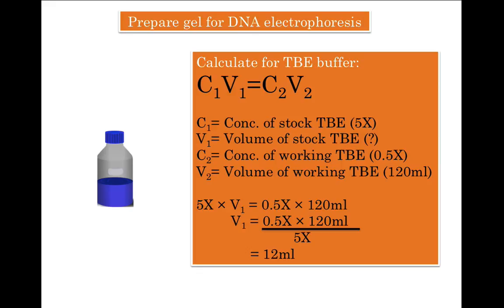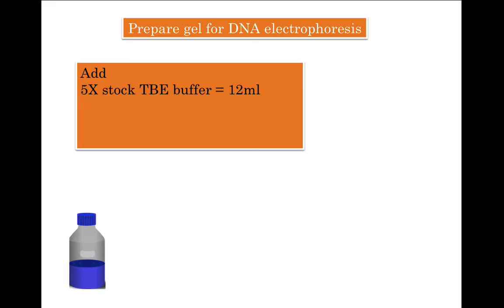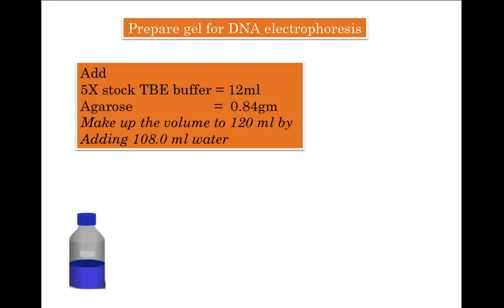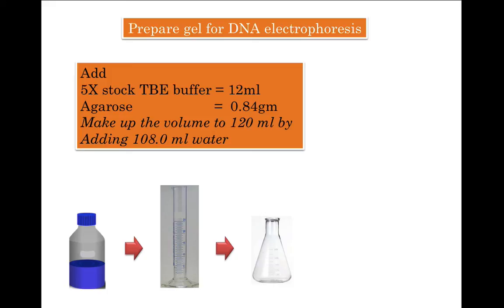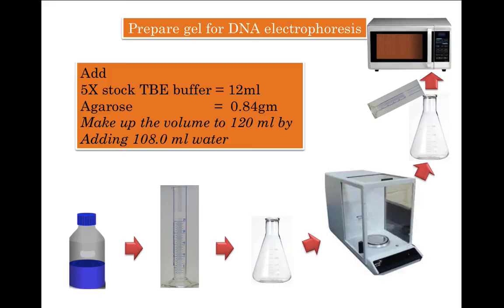So you need to take 12 ml of the 5x stock TBE buffer and make up the volume to 120 ml by adding water. To make the gel: take the 5x stock TBE buffer, aliquot 12 ml into a measuring cylinder, add 108 ml of water to make up the volume to 120 ml. Then weigh 0.84 grams of agarose, put it in a flask, add the buffer you just made, and microwave to dissolve. Let's do it!